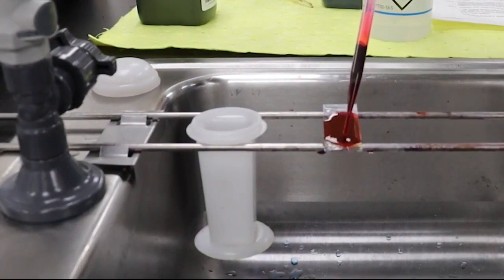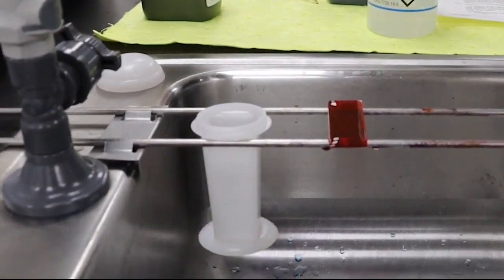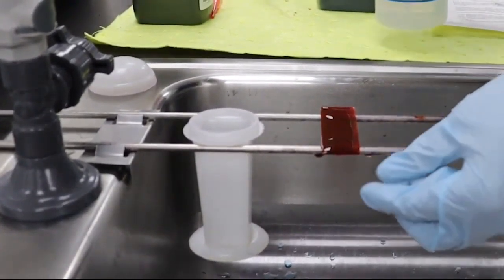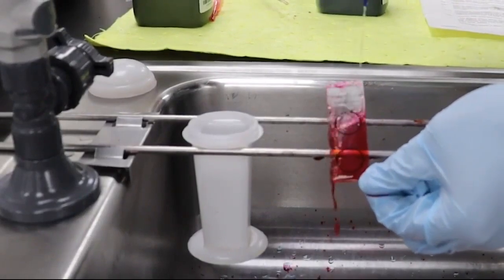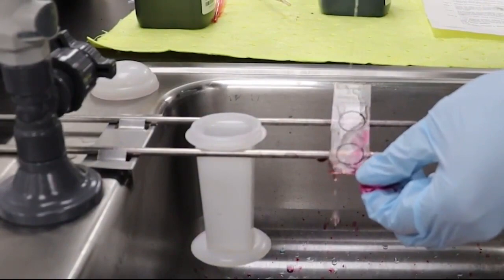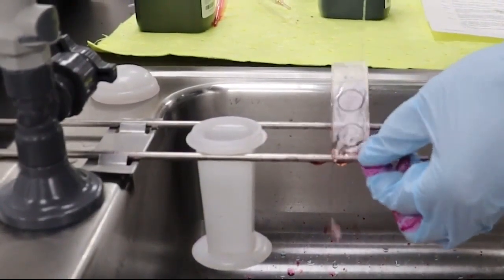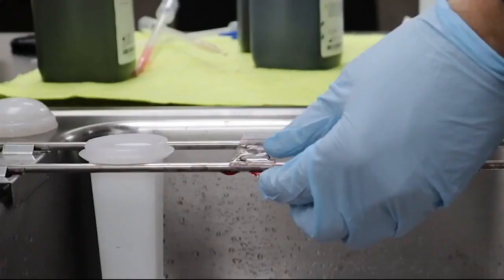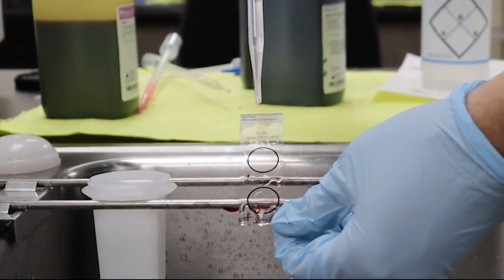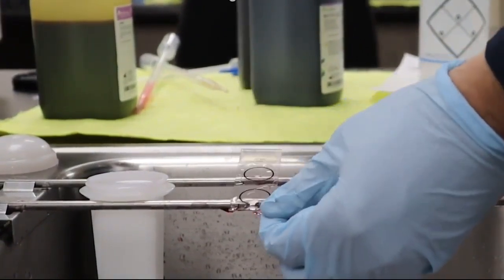Elitech Group combines the decolorizer and counterstain into a single efficient solution. Apply the decolorizer for 20 seconds for thin smears. Again, we suggest rinsing in gently running tap water instead of a spray bottle when possible. If the slide appears under-decolorized, reapply decolorizer and repeat the rinse. For some gram staining protocols, it's good practice to apply the decolorizer dropwise. This helps visualize the crystal violet being pulled from the gram-negative bacteria.